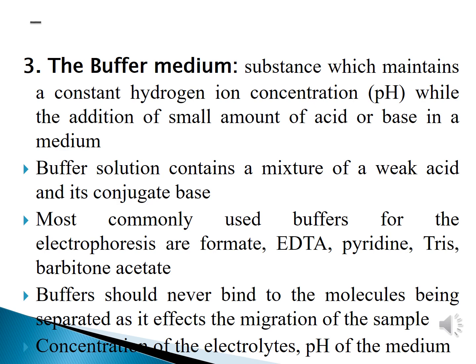Buffers should never bind to the molecules which are to be separated. That is, they should be chemically inert. We have to select such kinds of molecules as a buffer. Similarly, the separating medium should also be chemically inert with the particle that we are going to separate.